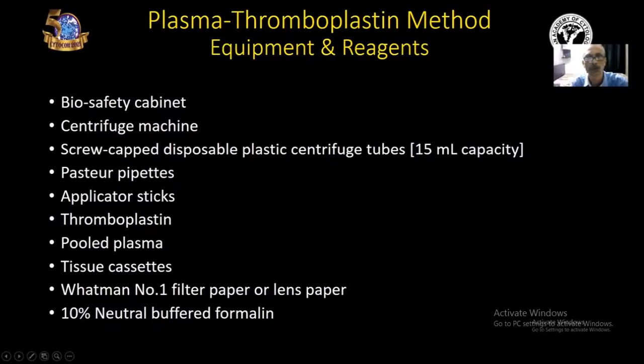Additionally, we need thromboplastin, pooled plasma, tissue cassettes, Whatman No. 1 filter paper and 10% neutral buffered formaldehyde.